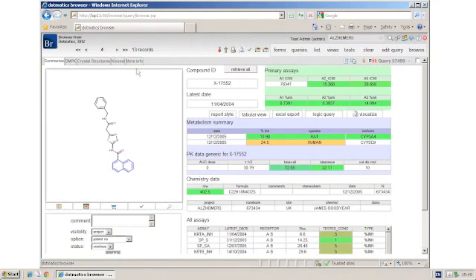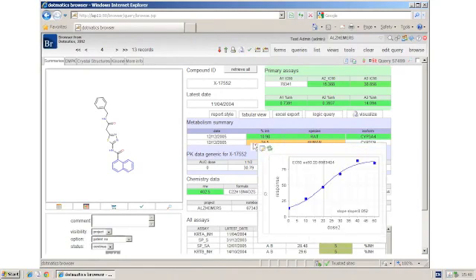I can mouse over information for drill downs. For example, a percent inhibition may have a mouse over to the original raw data.